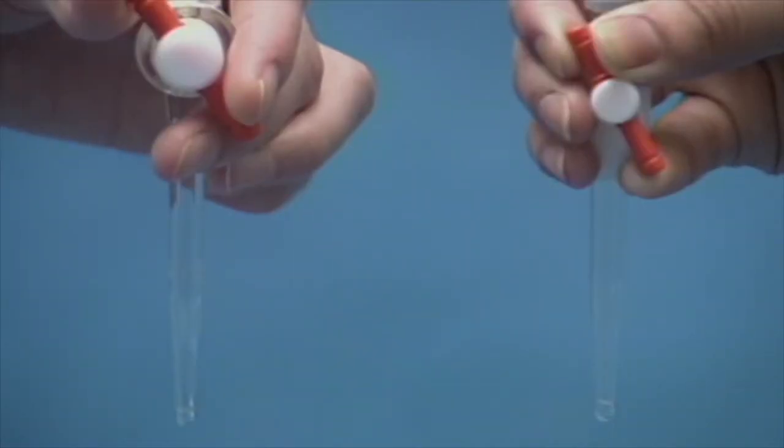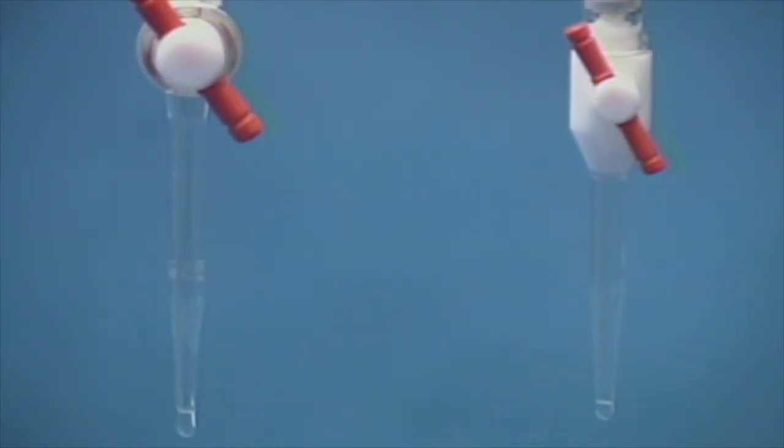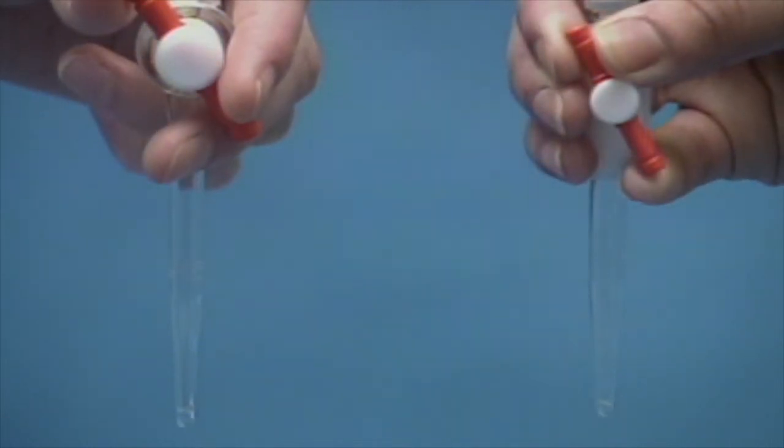By opening the stopcock the slightest amount, we allow drops to fall slowly. The flow rate of drops requires extremely fine adjustment. The drops fall more quickly as the stopcock is turned closer to vertical.